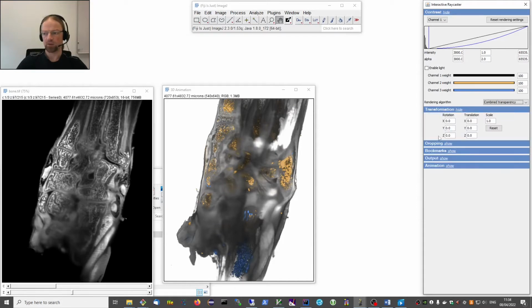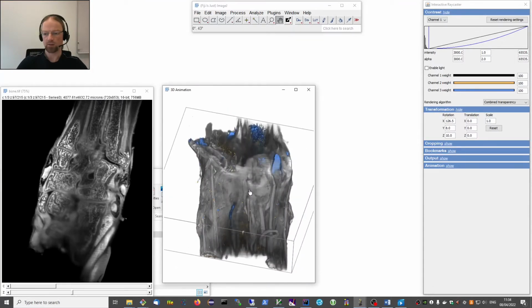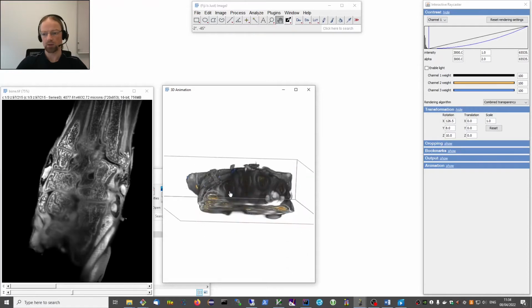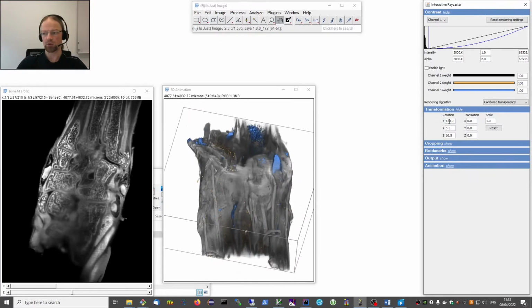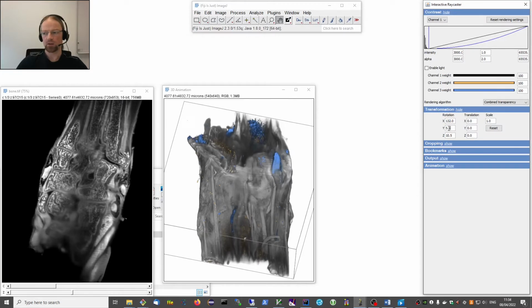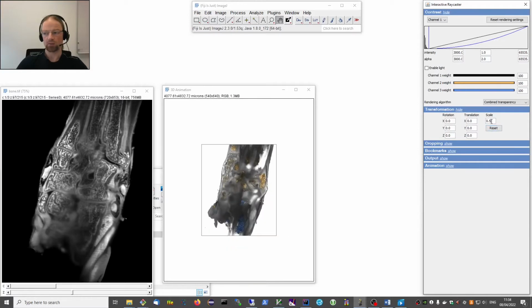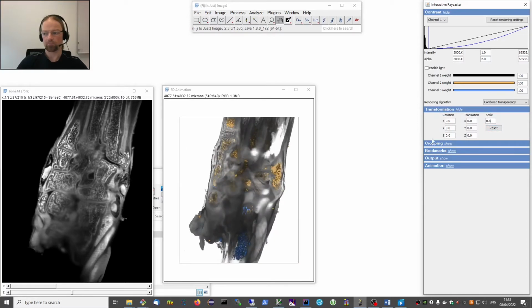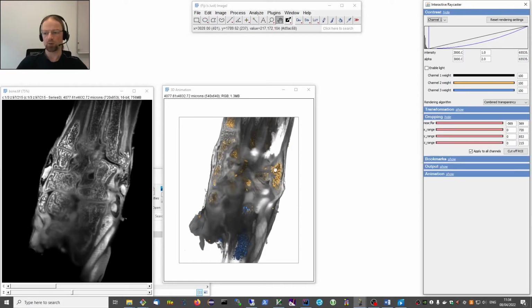There's not so much surprise here, so there's just the current transformation which we are looking at, and as I interact with the preview you see these values here for rotation, translation, and scale being updated. You can also change these transformations in these fields here. You can reset it to the default, and you can also scale, of course. Then there's cropping, which is probably more interesting.